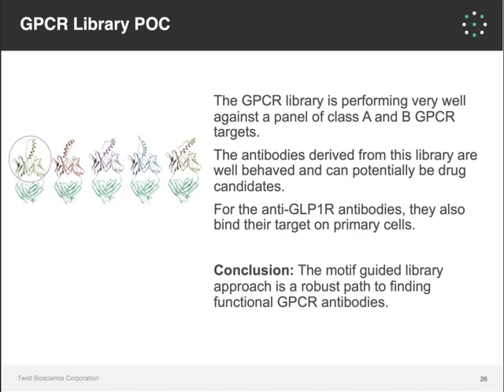From the selected clones post-screening, what percentage of them show functionality versus percentage of work in binding assay? When we make our antibodies, we typically use the sequence directly to choose a large panel of sequences to make.